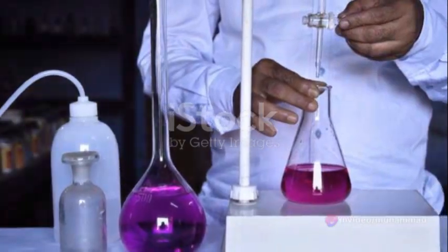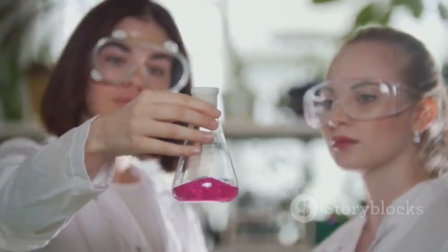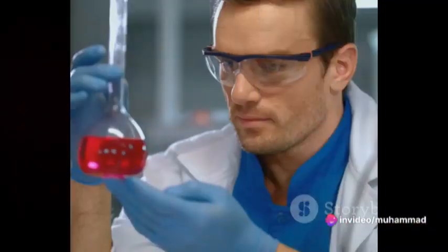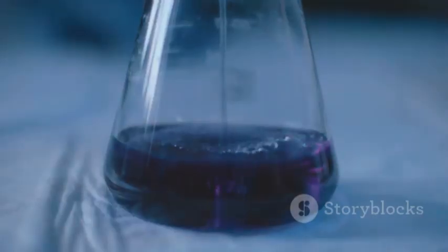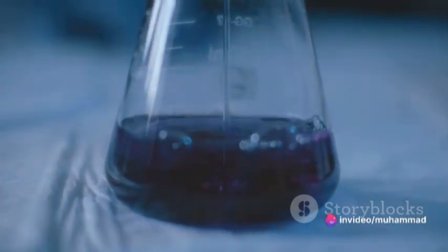An indicator is a substance that changes color at a specific point in the titration, which is known as the end point. This color change is a signal that the analyte and titrant have reacted completely. To ensure a precise measurement, the titrant is added slowly to the analyte. This approach allows the scientist to stop adding the titrant as soon as the end point is reached, thus avoiding an excess of titrant in the solution.